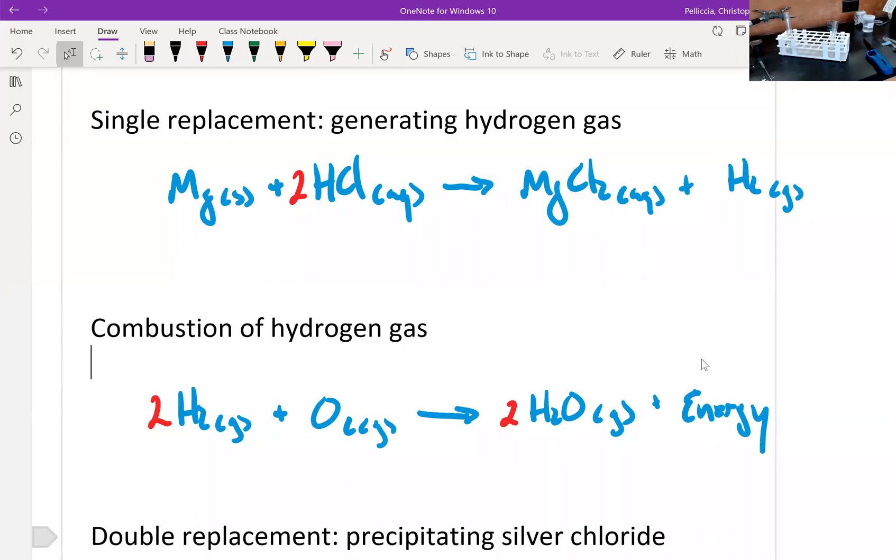Before we look at our final reaction, this is a good point to revisit the examples we've seen so far. You can see that the generation of hydrogen gas is still ongoing. That magnesium is still reacting with some hydrochloric acid left in the test tube. This is the decomposition of hydrogen peroxide. It is all but finished, though you still might be able to see some bubbles of oxygen gas forming in that solution of hydrogen peroxide. And for the single replacement between copper and silver nitrate, you can definitely see the blue color of the copper nitrate solution that's forming, and you can see some gorgeous silver crystals forming on that piece of copper metal.